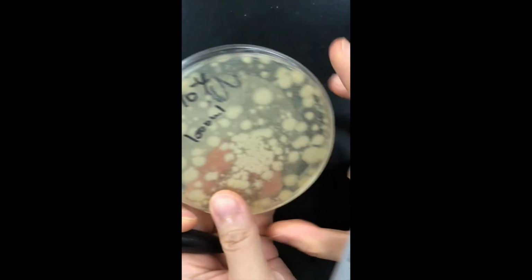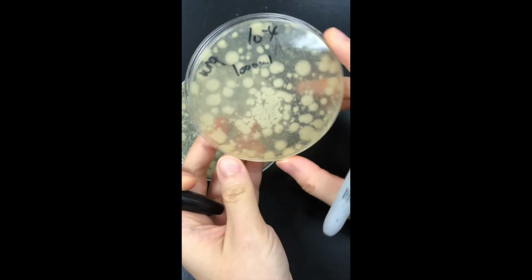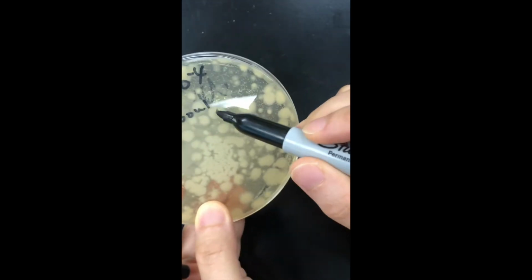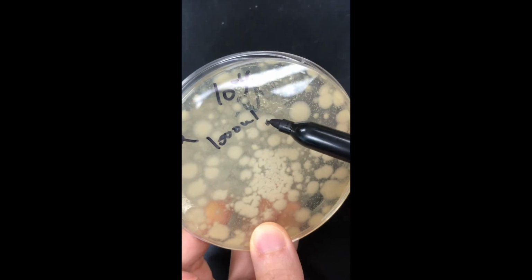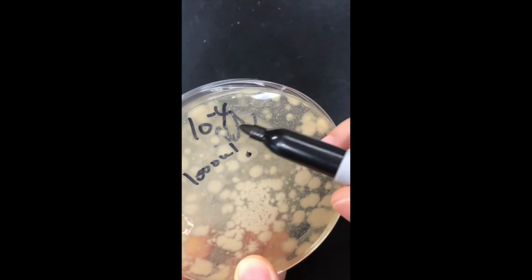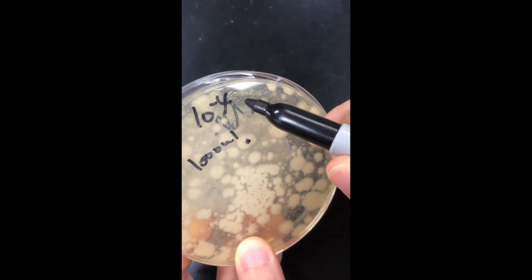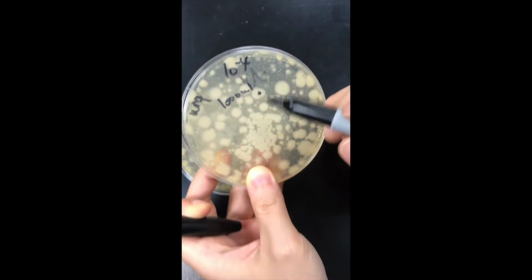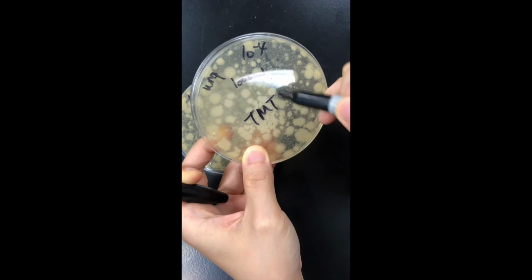How about 10 to the minus 4? It's almost the same. Not only the big ones, which would probably be Bacillus bacteria, we also have these small tiny dots. That's also bacteria cells. So too many to count.